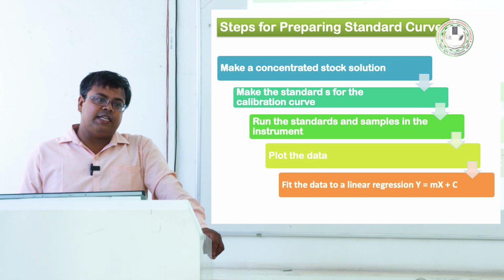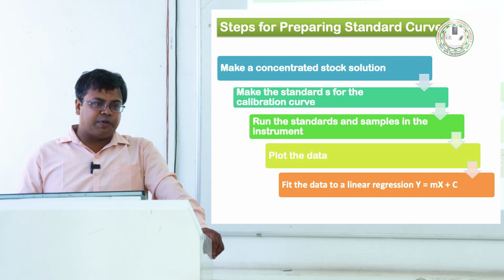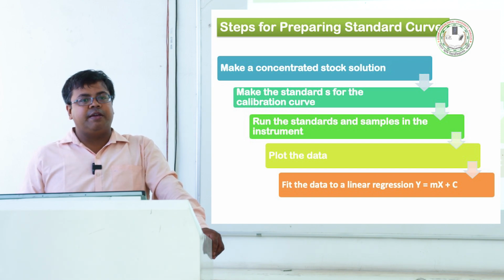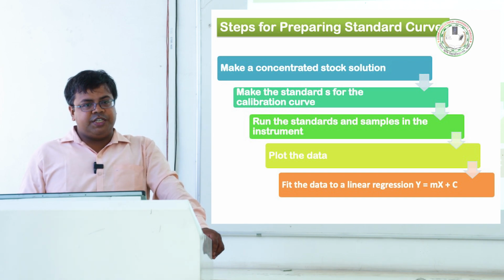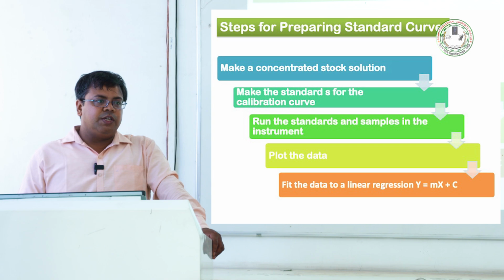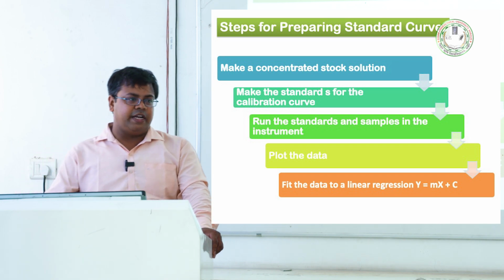Secondary standards are those whose concentration varies with time and space. That means the hygroscopic ones. When we want to measure such a chemical, what will happen? It absorbs moisture from the environment, so the actual weight will be lesser than the weighed weight. So these chemicals are called secondary standards.